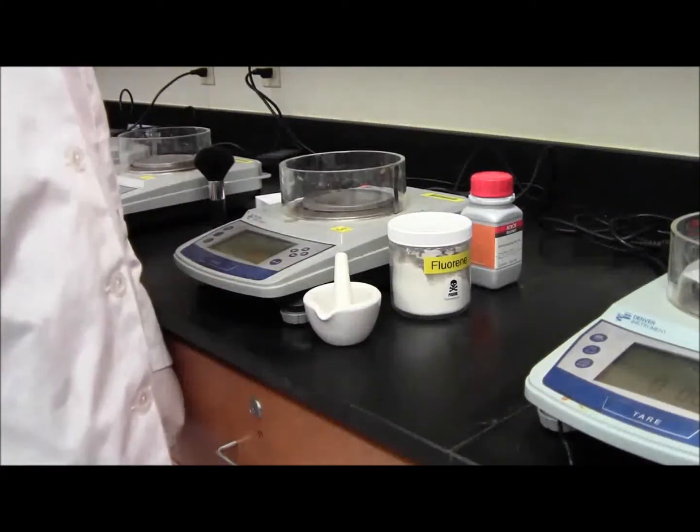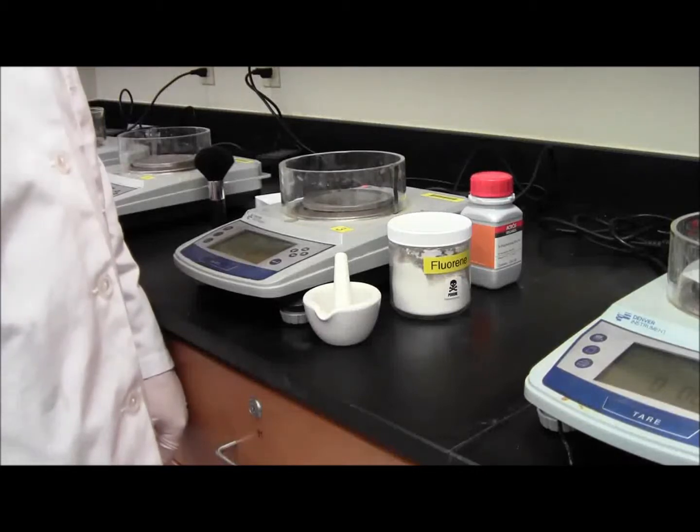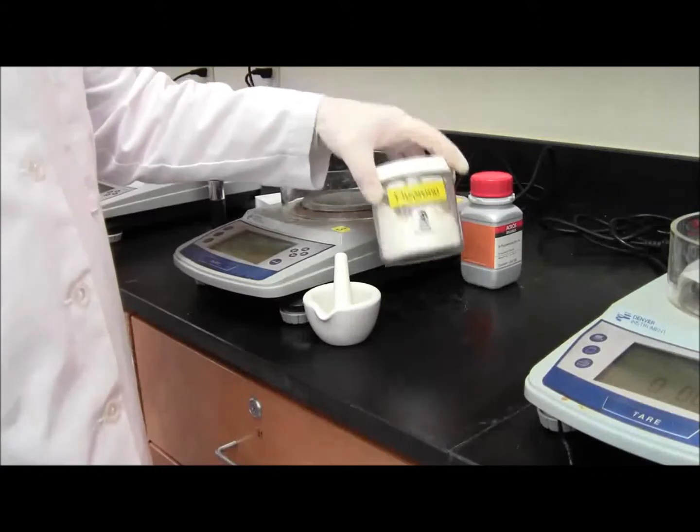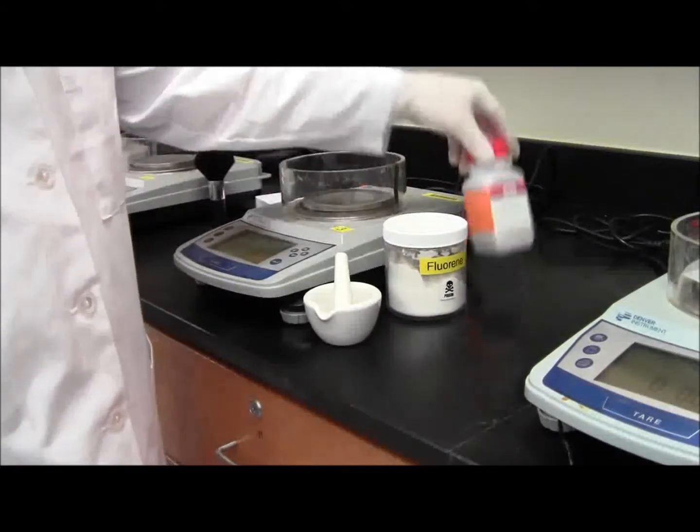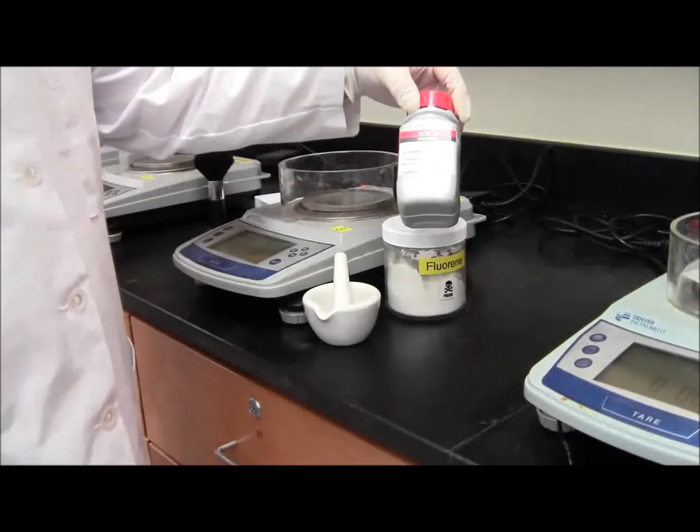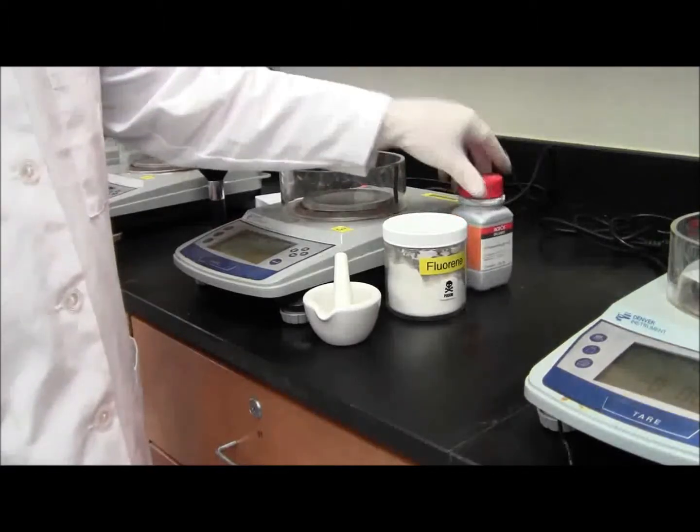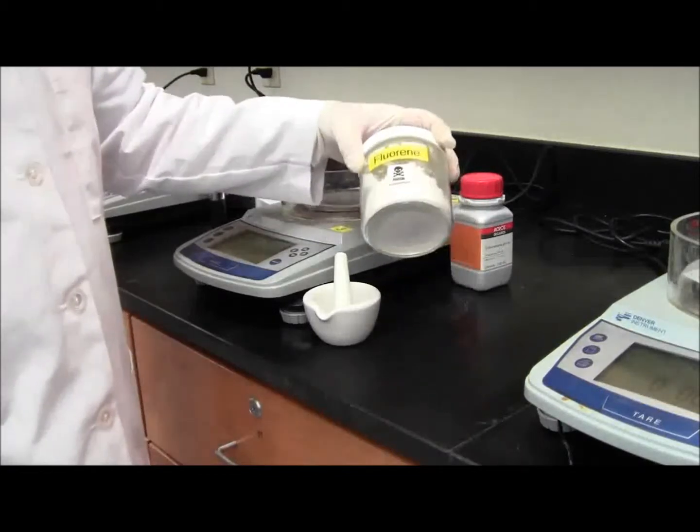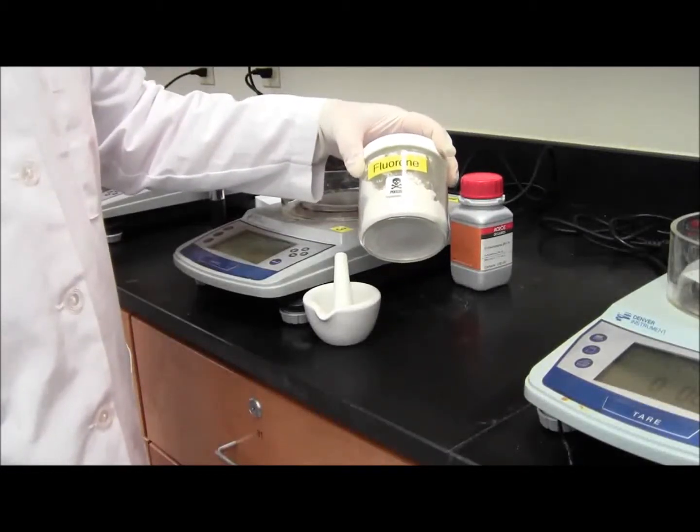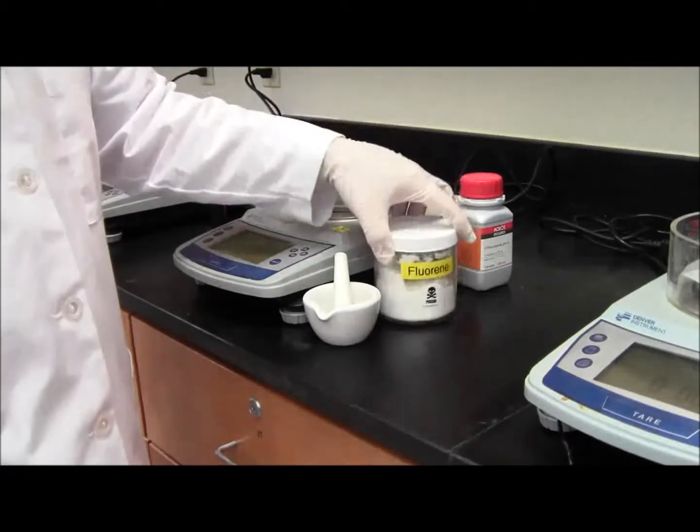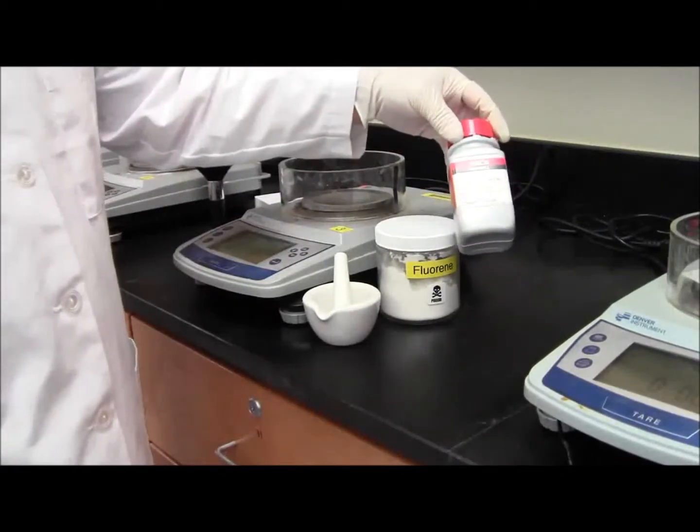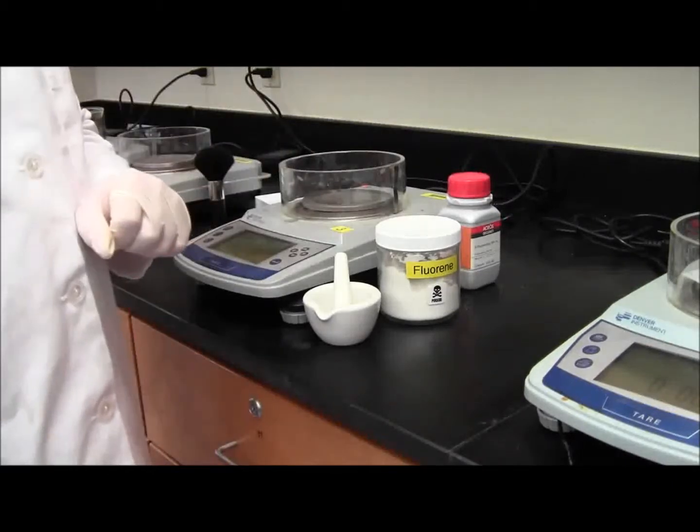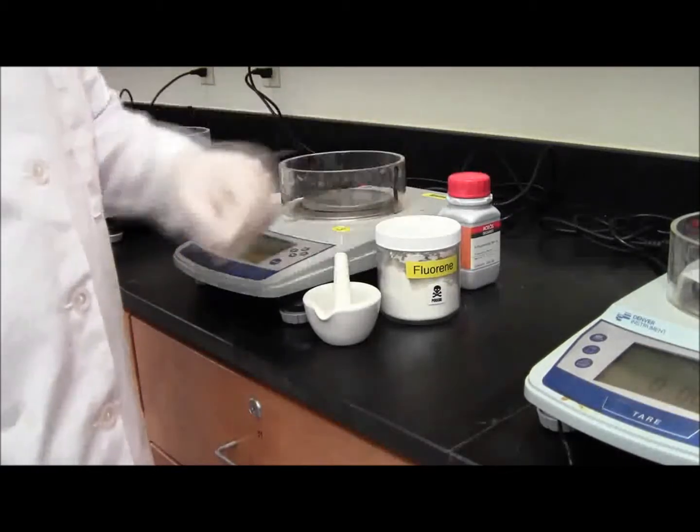In the second part of the experiment, we are going to add 0.95 grams of fluorene to 0.05 grams of fluorenone. This will be the desired product; this will be the undesired product. The fluorene is a white crystal. You will see that the fluorenone is a yellow crystal. Your final product will only have the white crystal.